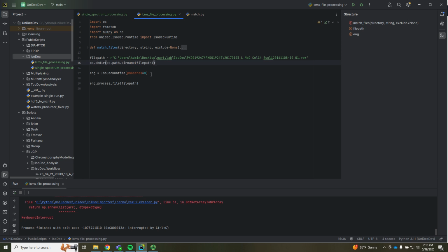And then just for the sake of time, you will not want to do this in really any case, but we're gonna reduce the knockdown rounds to 1. The only purpose of that is to allow this to finish processing sooner, so we can fit more into this video without hanging out and waiting.